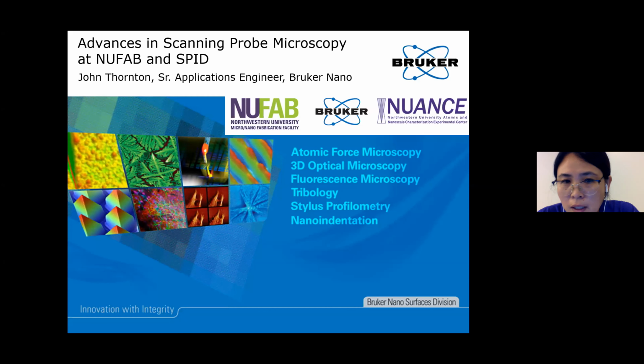I am the research associate at NUFAB Cleanroom, and here in the panel we have Dr. Gajendra from SPID. Both of our centers have a few AFMs for offering to users as research tools. From my side, NUFAB Cleanroom has been recently expanded. We have a couple of new thin film tools like ALD, and also a few thin film deposition tools. We also have the new E-beam writer coming. At the same time, we have a few dry etching and wet etching tools to help the users conveniently check their patterns and meet the requirement of contamination free.